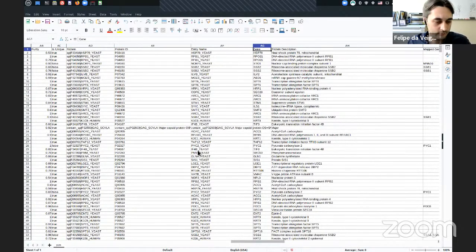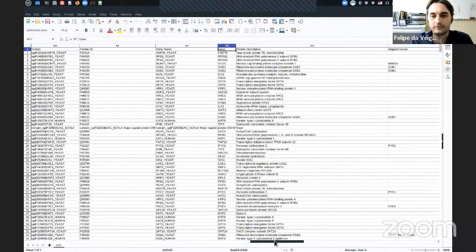This comes back to what I mentioned before about having a good FASTA database. If you're using a FASTA database formatted with one of the common headers that we see in UniProt, Ensembl, or NCBI, all this will be filled with information like this. Otherwise, it will be blank because the program cannot figure out what kind of information you have in the headers.